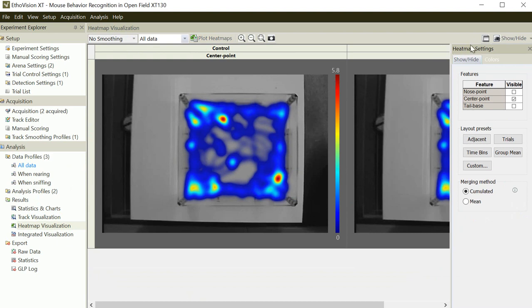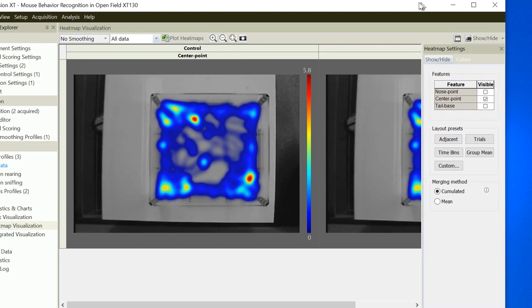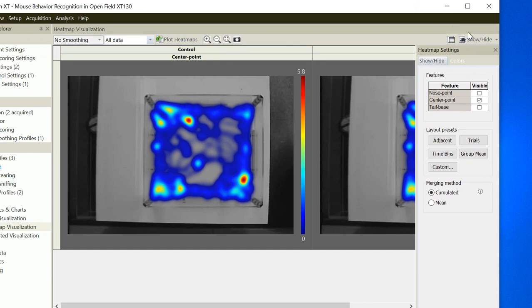So this should be a very interesting visualization of your data, and you can utilize those visualizations in your presentation or PowerPoint slides or anything like that. So in that case you can choose. Let's slide a little bit.